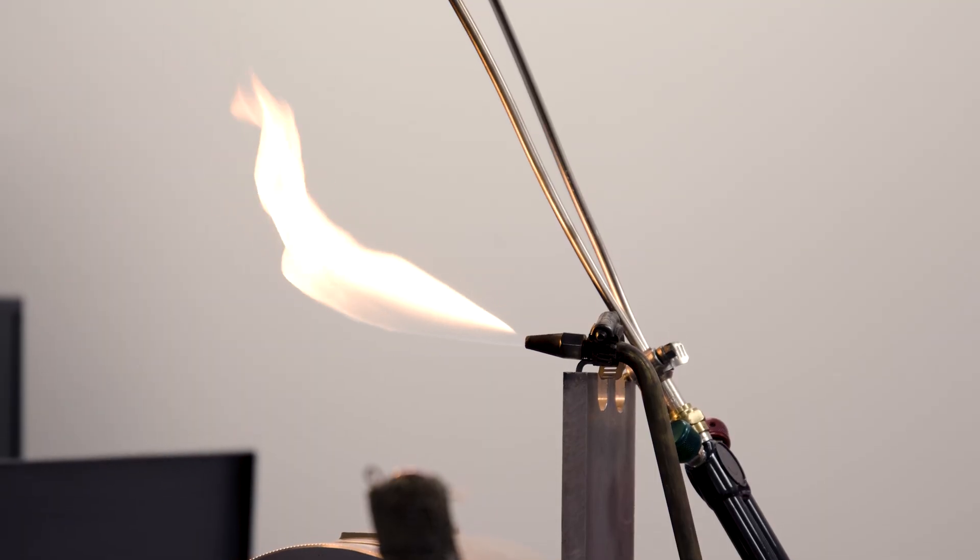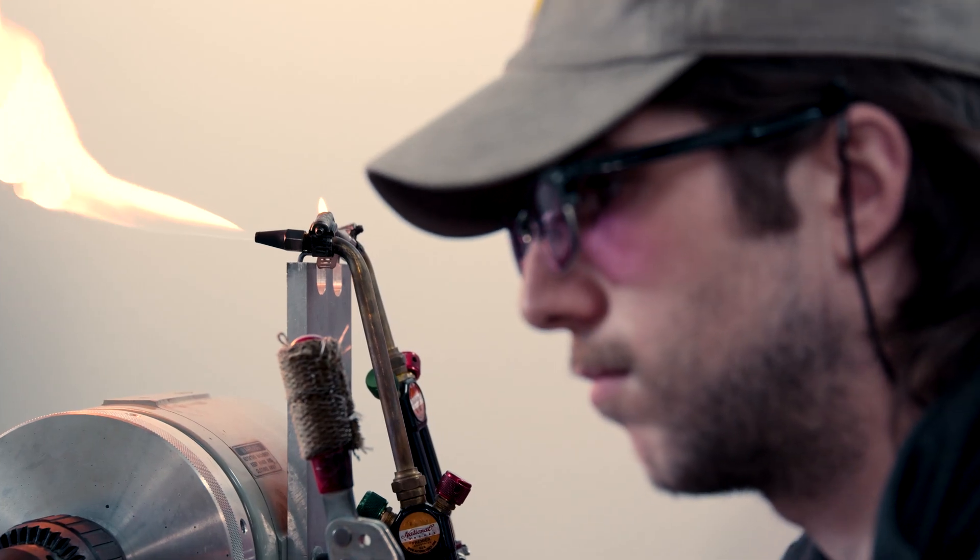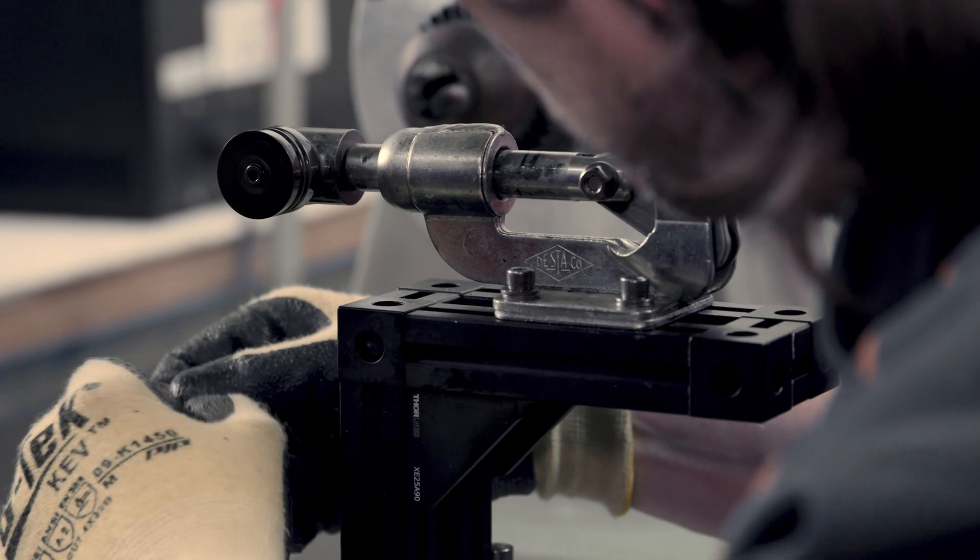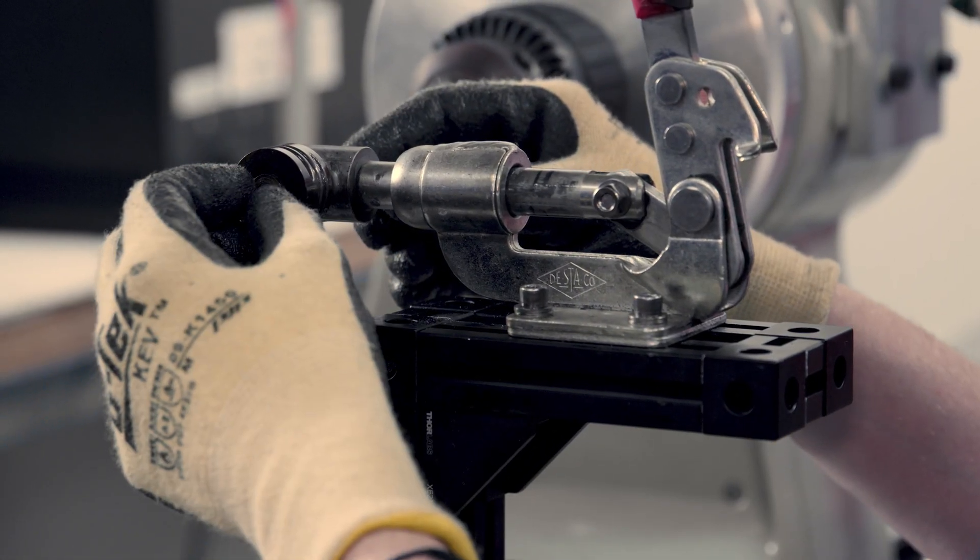The thing I enjoy most about glassblowing is you kind of lose yourself in it. Whenever I'm doing scientific glass, I have to kind of be on my toes at all times.